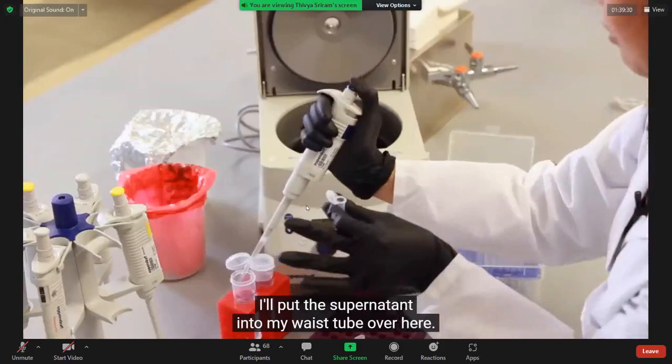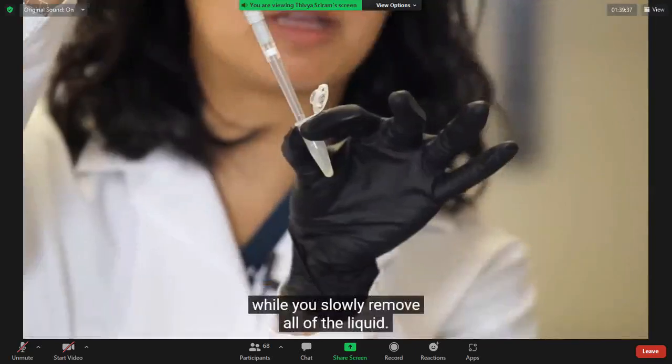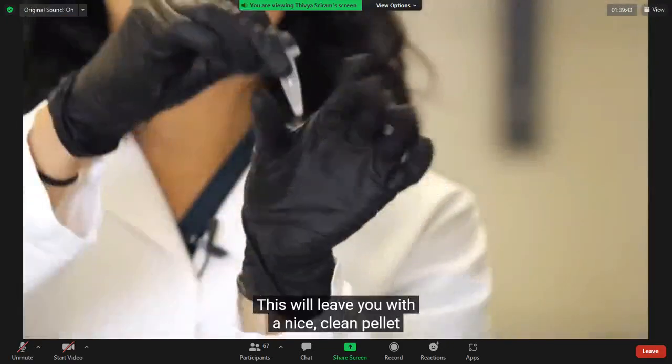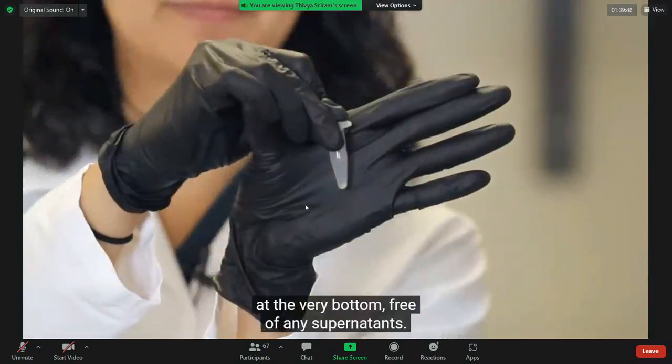You want to make sure you don't put your tip all the way to the bottom where it's going to touch the bacterial pellet, but just let it skim gently at the top while you slowly remove all of the liquid. Just like that. This will leave you with a nice, clean pellet at the very bottom, free of any supernatant.